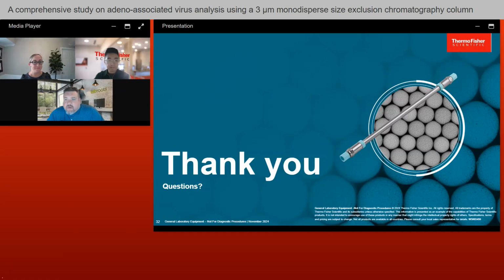Thank you. Can the SEC separate empty versus full AAV?